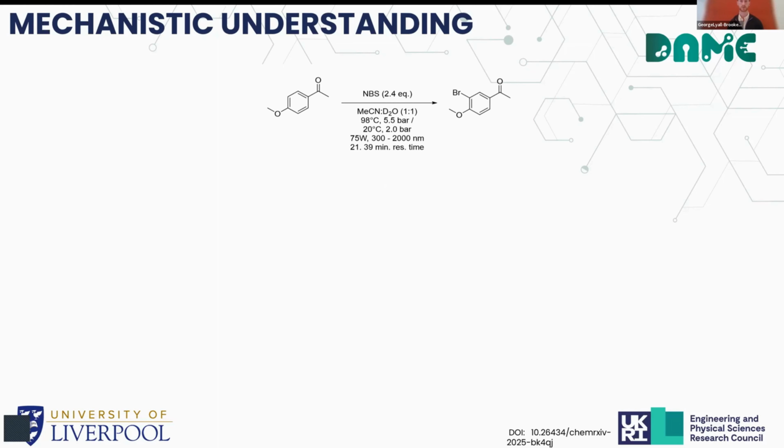the successful transformation. So we then probed whether altering the water in the solvent system for D2O would impact the reaction, and whether we would see a kinetic isotope effect across both the heat activated and UV activated procedures.